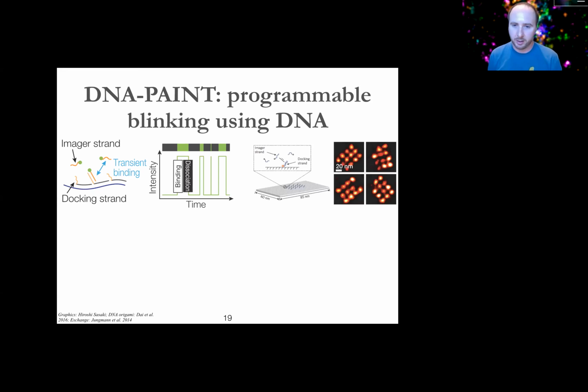And nice ways that we can validate that this approach works is, for instance, programming two-dimensional DNA origami nanostructures, putting them down on a surface, like I'm showing you here on the top right of the slide, and then trying to resolve these strands that we projected and define patterns that are certain distances apart. I find this very satisfying because if we say we have X nanometer resolution in our imaging and we actually have features that are on that length scale or smaller that we can resolve, it does a convincing job of saying that that resolution estimate that we make has meaning in the system.